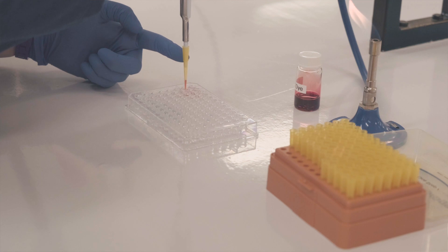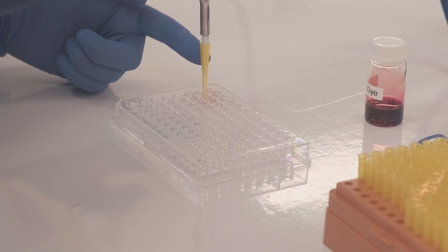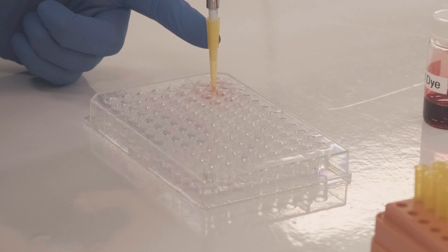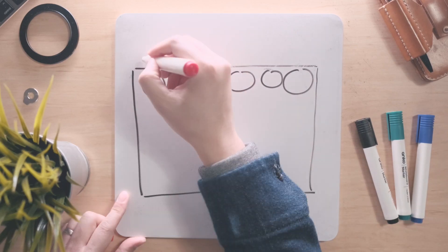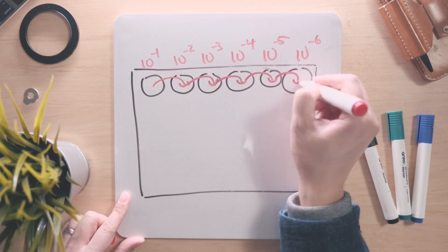When you're convinced that the first dilution is homogenized, remove 10 microliters from this well and pipette this into the second well, which also contains 90 microliters. This is the second 1 in 10 dilution, and now this well has 100 microliters of reaction volume. Thoroughly mix again by pipetting up and down. We'll repeat this process until we have performed six 1 in 10 serial dilutions.